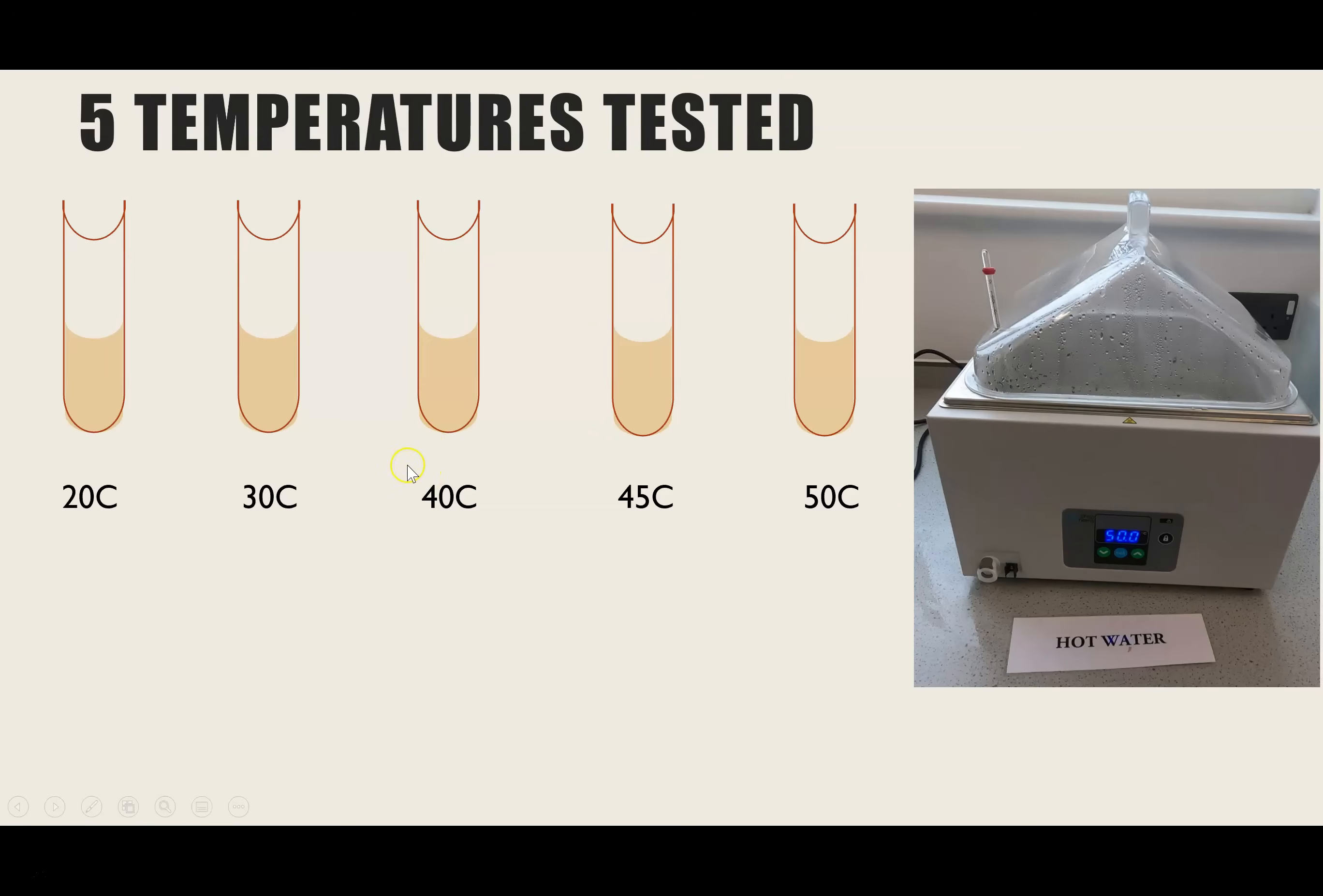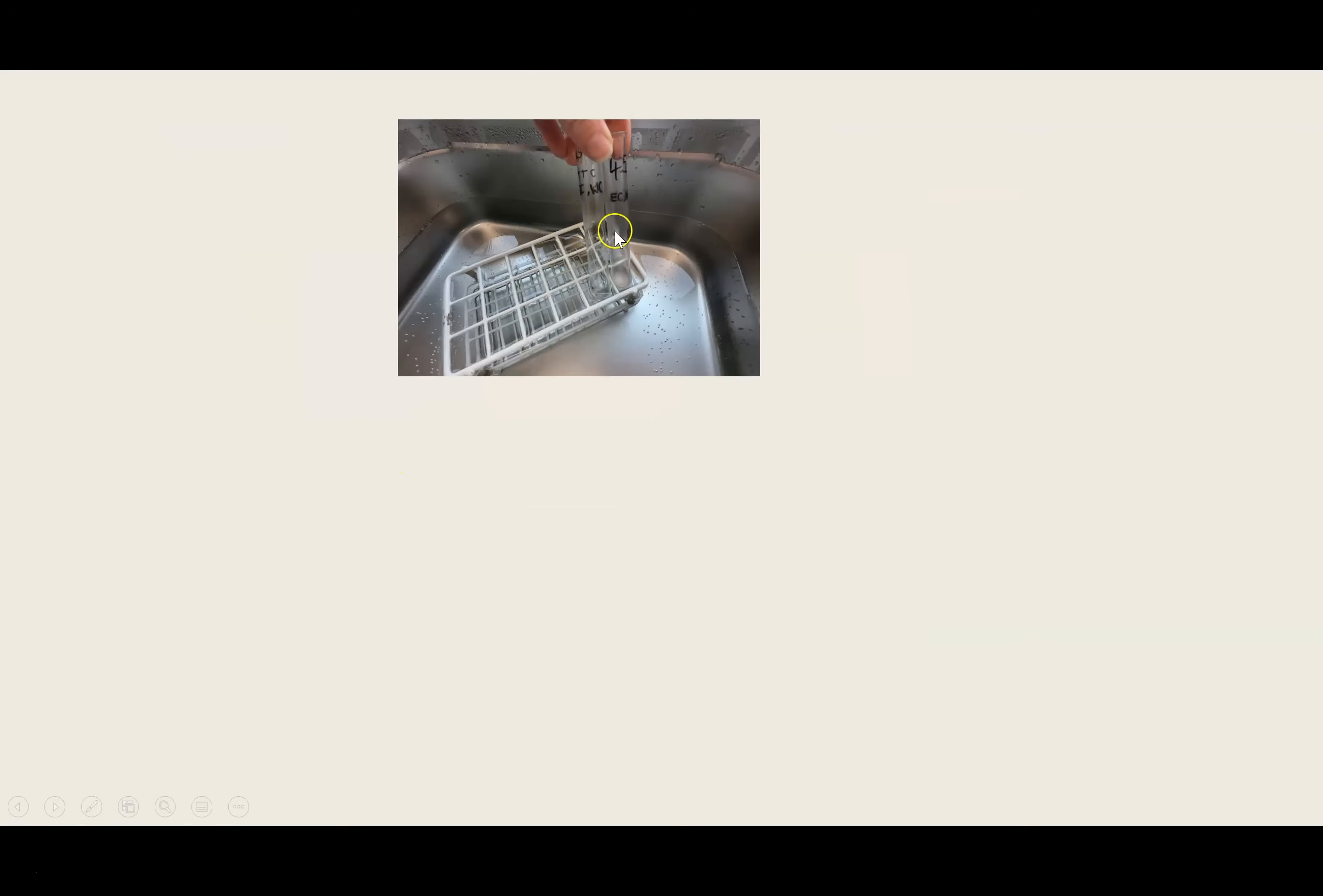If we're saying that we are testing the rate of reaction at 40 degrees C, we need to make sure that both of those solutions are at 40 degrees C before we start the reaction. So we'll leave them for a minimum of five minutes before we check to see if they have both equilibrated to the temperature of the water bath.